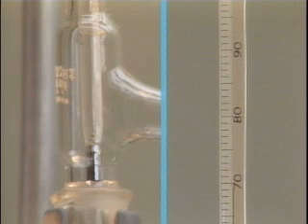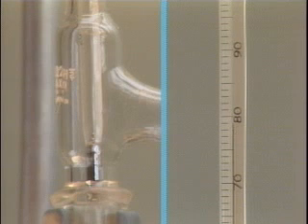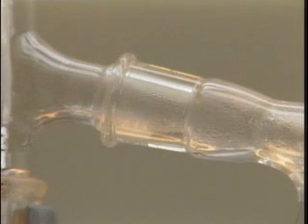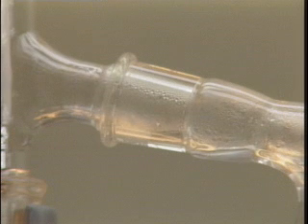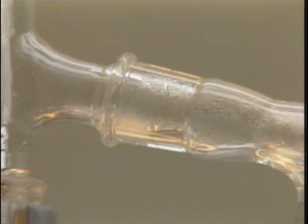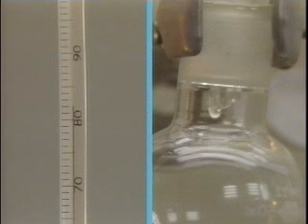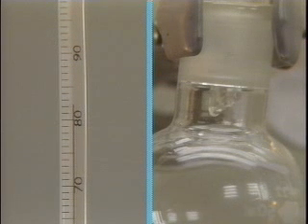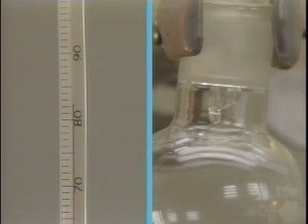There is a sudden rise in the temperature shown by the thermometer reading when the hot vapors reach the thermometer bulb. As the hot vapors of the distillate move through the water-cooled condenser, they liquefy. The distillate runs through the adapter into the collection vessel. The temperature observed when the first drop of distillate is collected is recorded as the beginning of the temperature range for the distillate. The distillation is continued until the desired amount of distillate is collected.